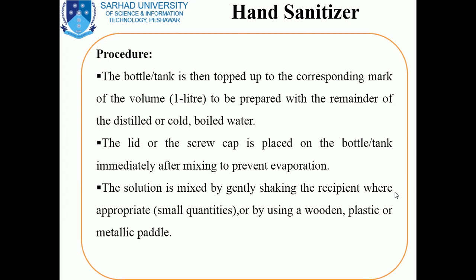The solution is mixed by gentle shaking of the recipient where appropriate, that is for a small quantity, or by using a wooden or plastic or metallic paddle. We can shake it gently if the quantity is small, or if the quantity is large, we can use a wooden paddle or maybe a plastic or metallic paddle.